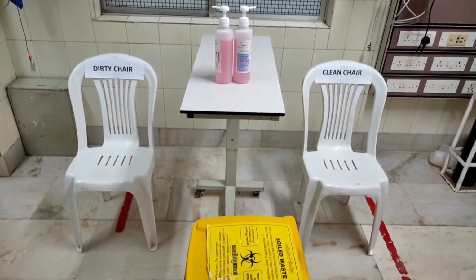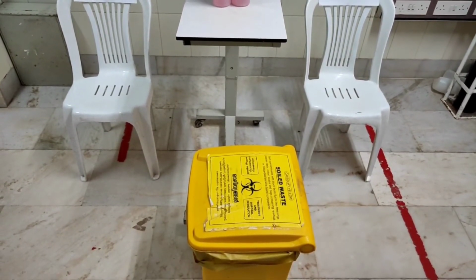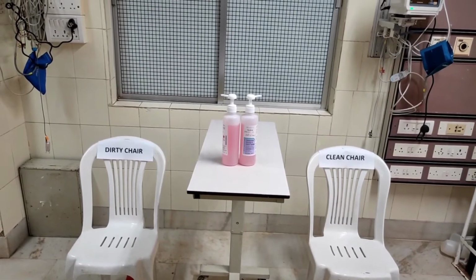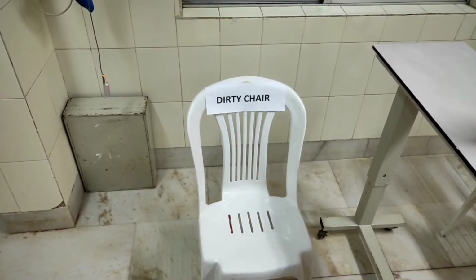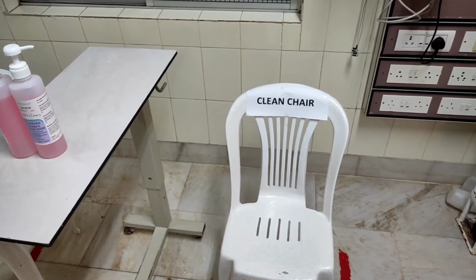Every designated doffing area should have a biohazard bin clearly labeled and should have two designated chairs, a dirty chair and a clean chair, and also an area with proper hand sanitizers. The dirty chair is to be used by the person who is coming out of the decontamination unit for removing the PPE, and the clean chair should be used by the person only after properly removing the PPE.